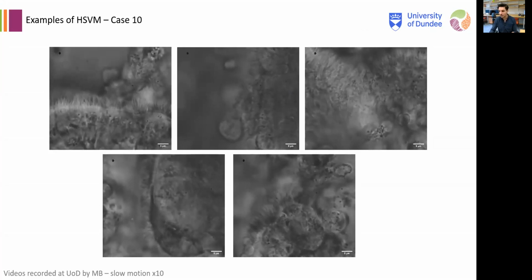Yes. Thank you, Eva, for pointing out. It's actually rotating. We see rotation here. We can get the rotation on the side view. It's a bit harder, but if you were to follow one cilia, look at this area here, how the cilia keeps coming out of focus. So this is exactly a pretty example of so many cilia rotating in one sample. And so this patient actually has the RSPH9 mutation.